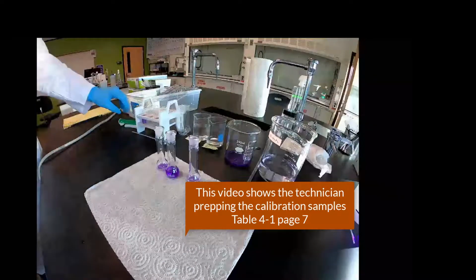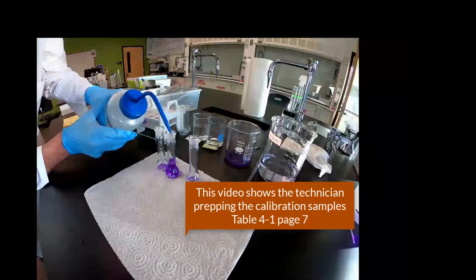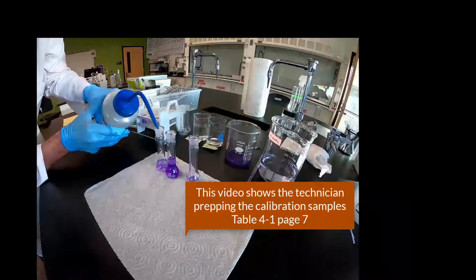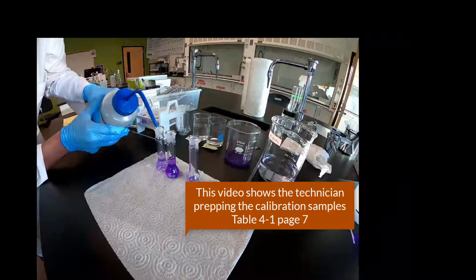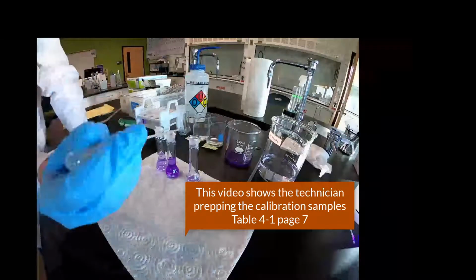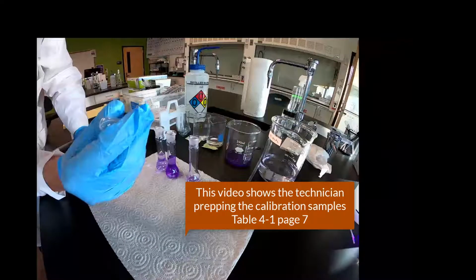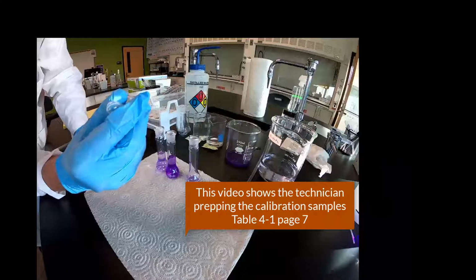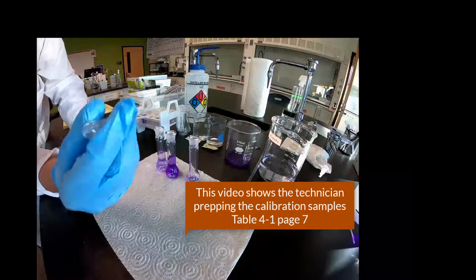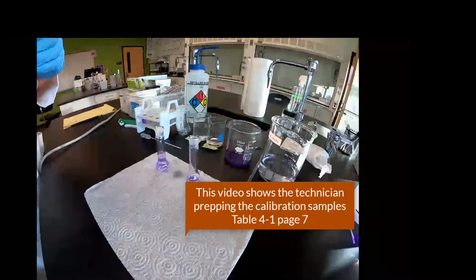Now we're going to dilute to the mark with water. So it's going to go to the 10 ml mark. There you go. You can get it really close with the squirt bottle, but when you get it right to the mark, what you want to do is get those little droppers so you can precisely add the last amount of water. Okay, that's right. That throwaway dispenser will add drops of water very carefully. It's a good way to go. So he's done that, got it right to the mark.